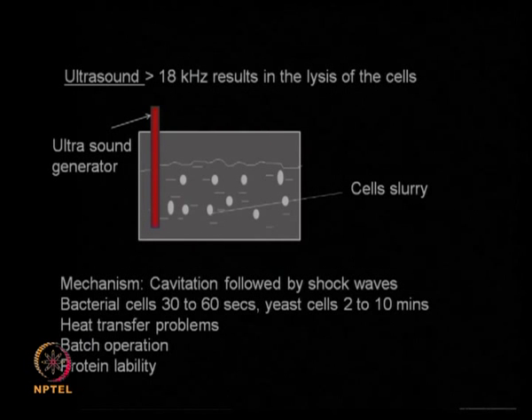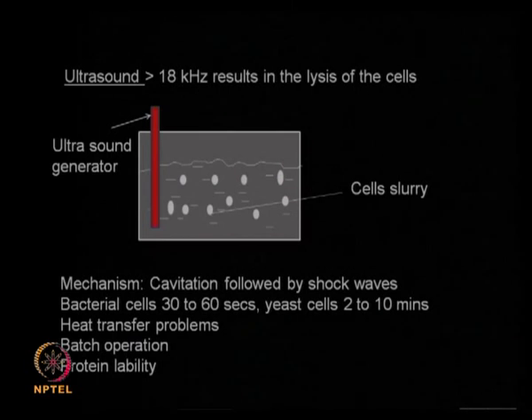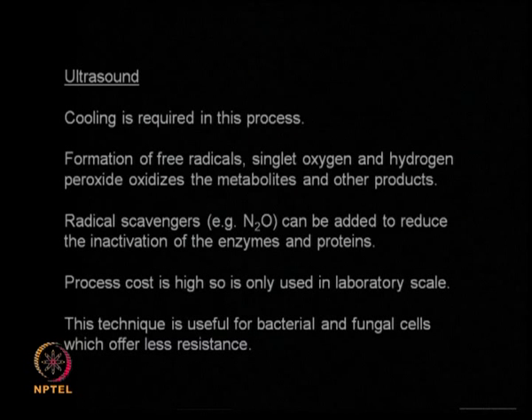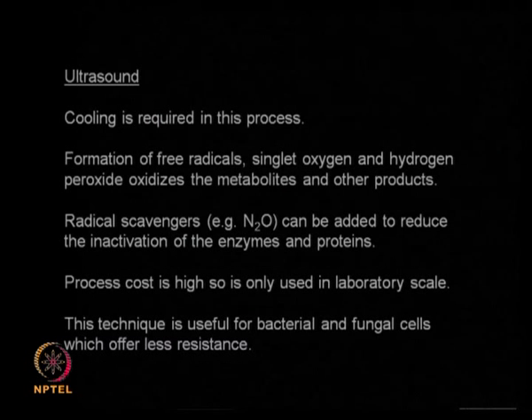The third problem is protein lability, that means a protein can get denatured because of the shock waves or the cavitation, or because of the high temperature or hot spots generated. So you need to be very careful about this problem. We need to have cooling in this type of situation.